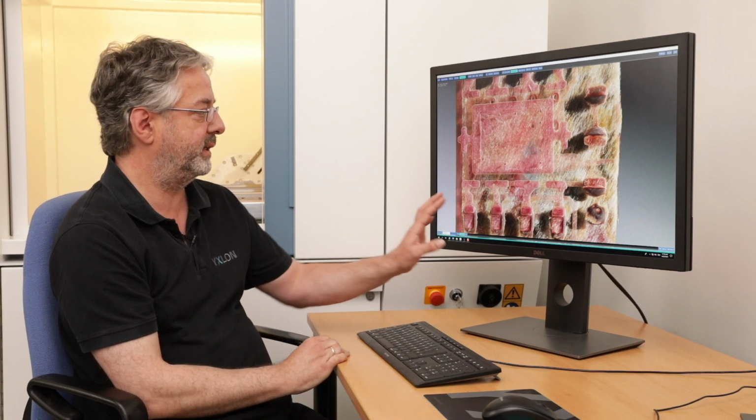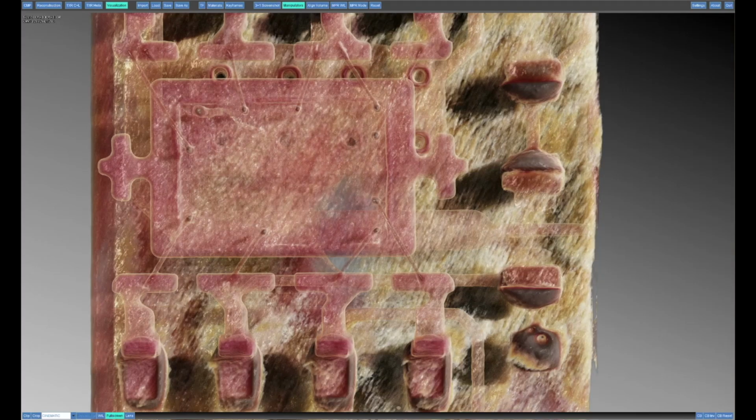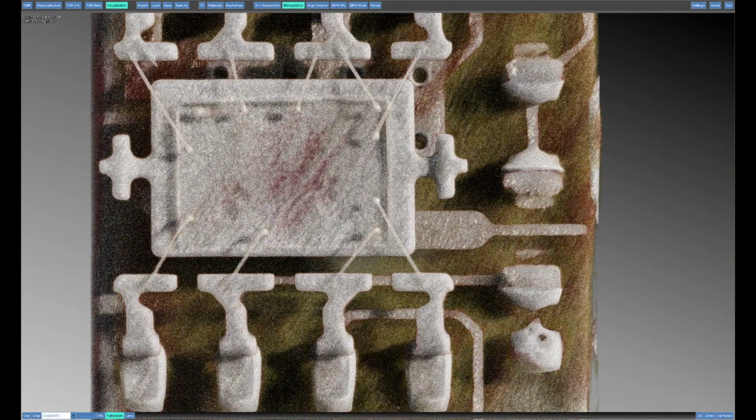Like this one here. So the cinematic renderer is working with a lot of shadows, and it's really a realistic view to your sample. Let's select another transfer function like this one here. And you see it's only one click.